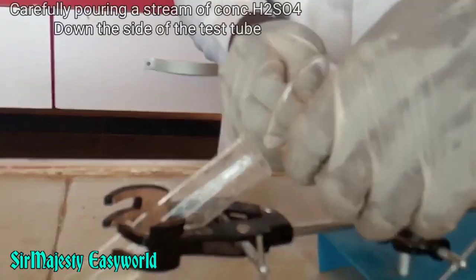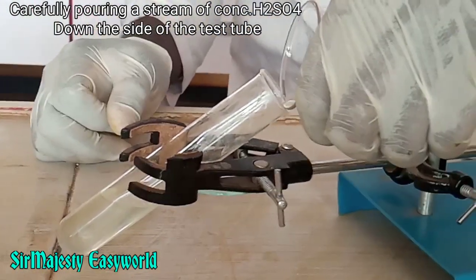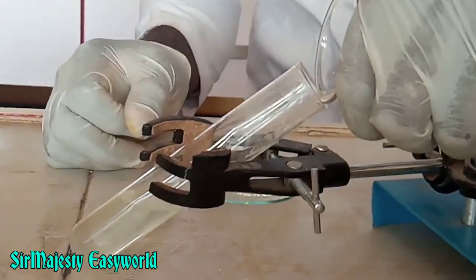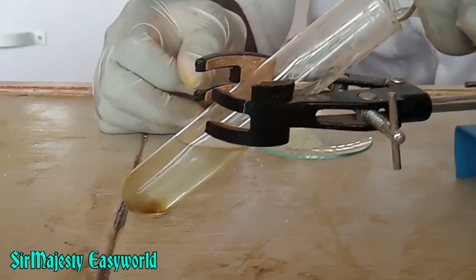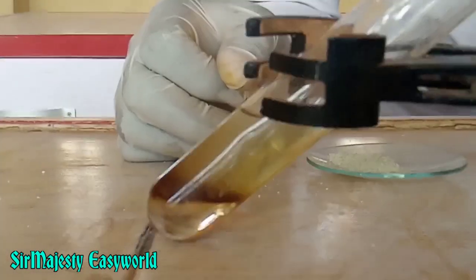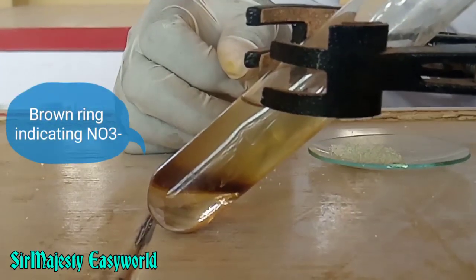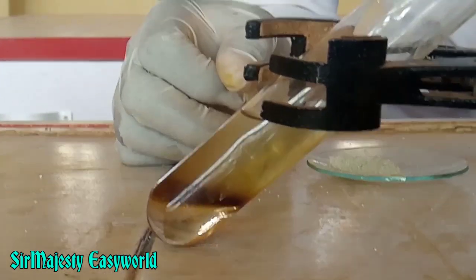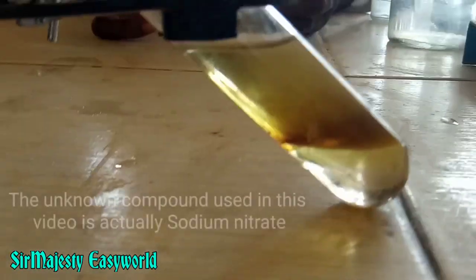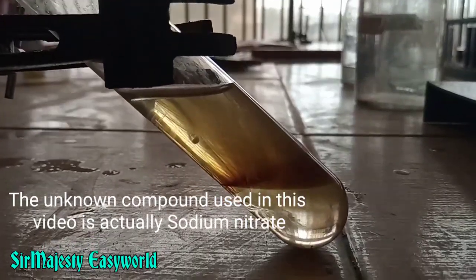Carefully pour a stream of concentrated tetraoxosulfate(VI) acid (concentrated H₂SO₄) down the side of the test tube held in a slanting position. If the unknown compound is a nitrate, a brown ring appears at the junction of the acid and the aqueous layer.